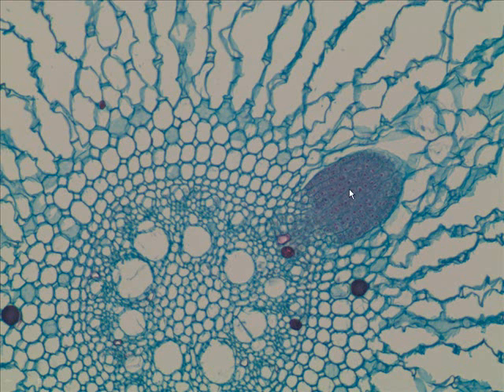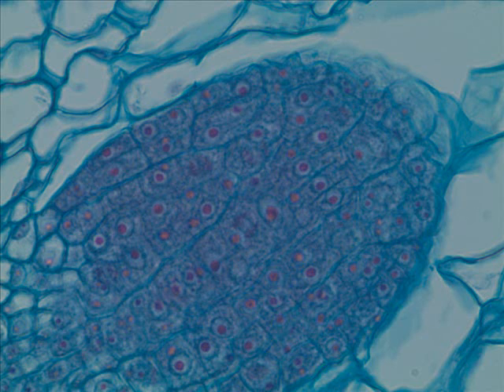But anyway, we do know that this branch root is developing from which tissue layer? It's developing from the pericycle. Let's take a closer look at this little branch root. What would you call this area right out here at the very end? You call that the what?